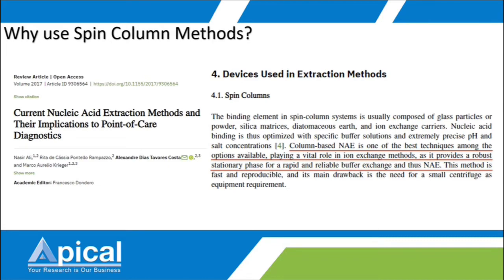This method is fast and reproducible. One drawback is you need a small centrifuge. I believe this is not a problem for a molecular lab, certainly nearly all molecular labs will have a centrifuge, right?